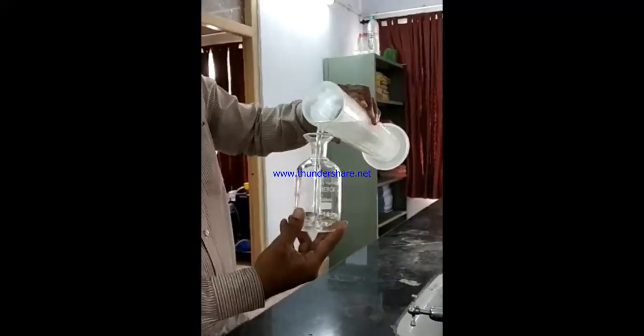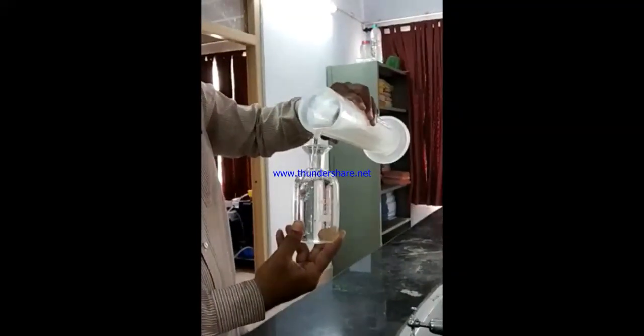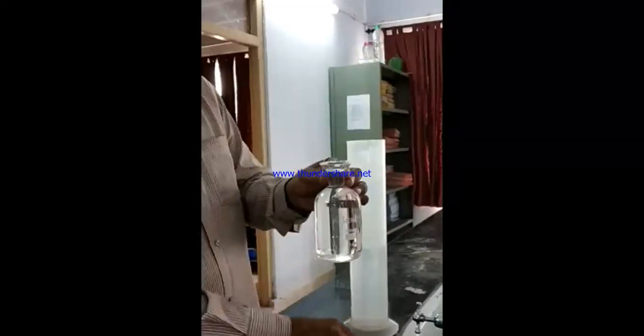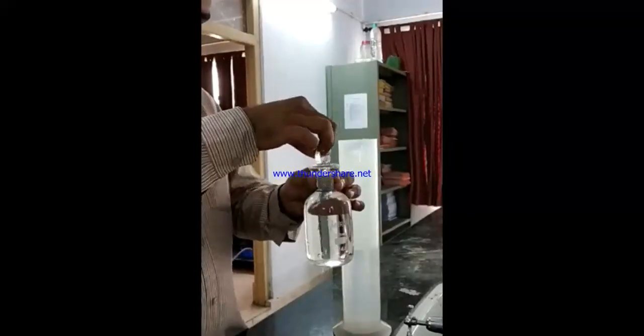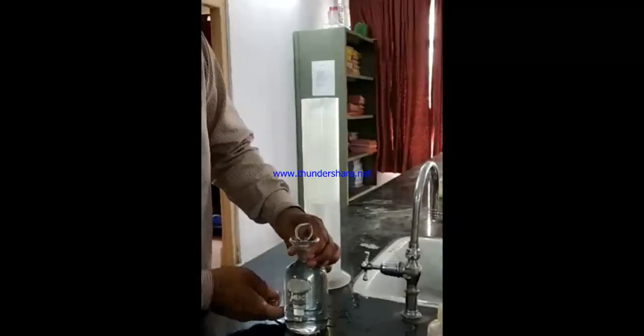The water sample is taken. This is complete 300 milliliter. We can also take, suppose, 50 ml water sample and do volume makeup up to 300, and we should do that for finding out the dilution ratio. For finding out the dilution ratio we have to dilute. Now this is the pipette. We will take 1 ml of manganese sulfate and 1 ml of alkali iodide azide.